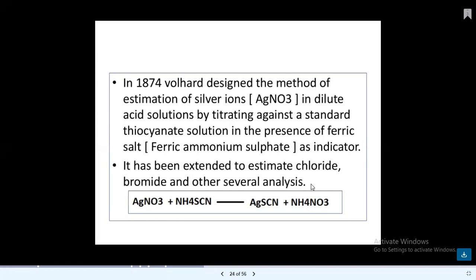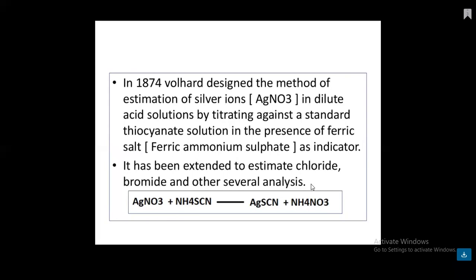Okay, we understand this step by step. The first thing is that our analyte is the halide one. Our analyte is the halides, either chloride, bromide or iodide.